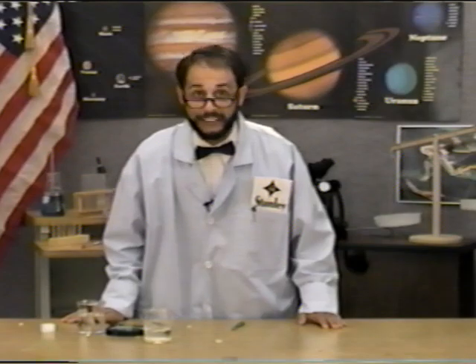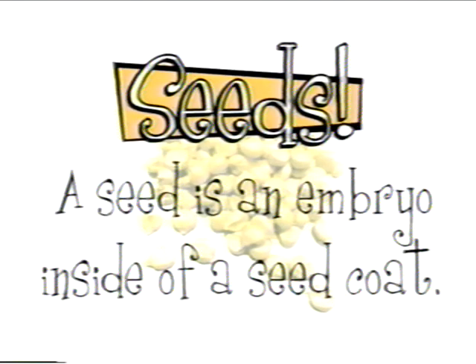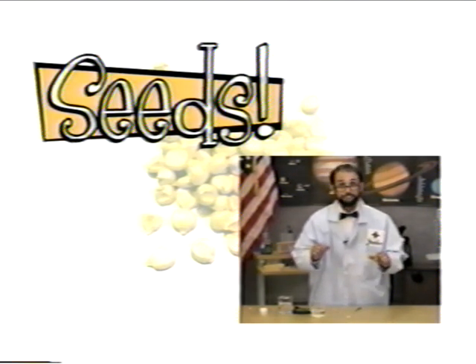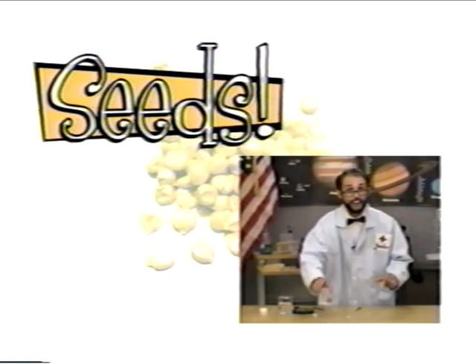Hi. Today, we're going to take a look at seeds. A seed is really an embryo inside of a seed coat. To get a better look at the embryo, we're going to cut one seed in half and then observe another seed. These will be a lima bean and a piece of corn, which I have soaked in water overnight.